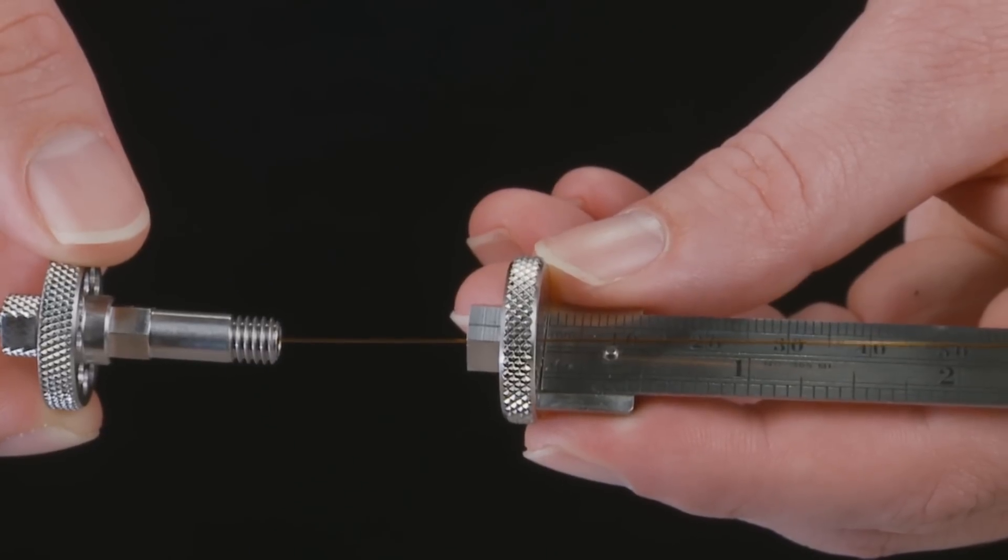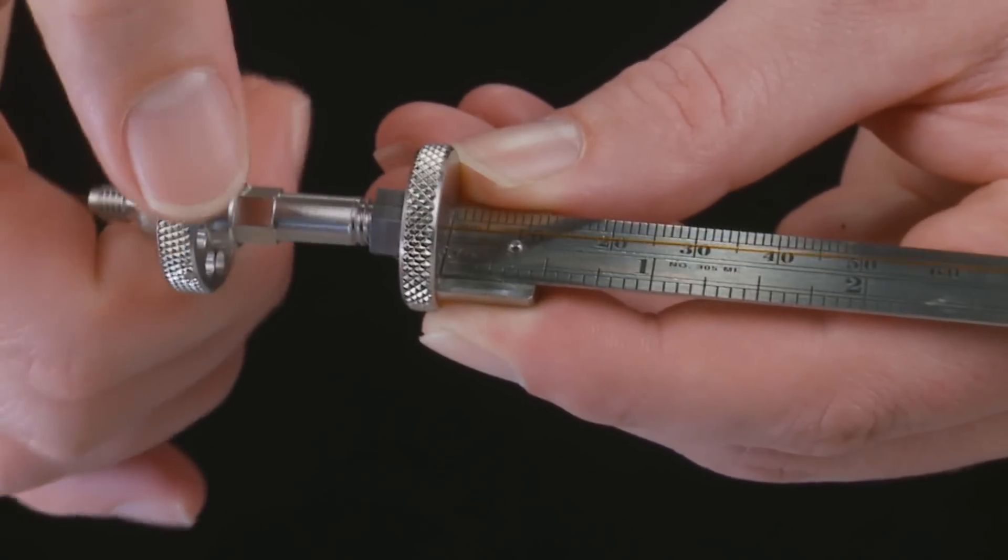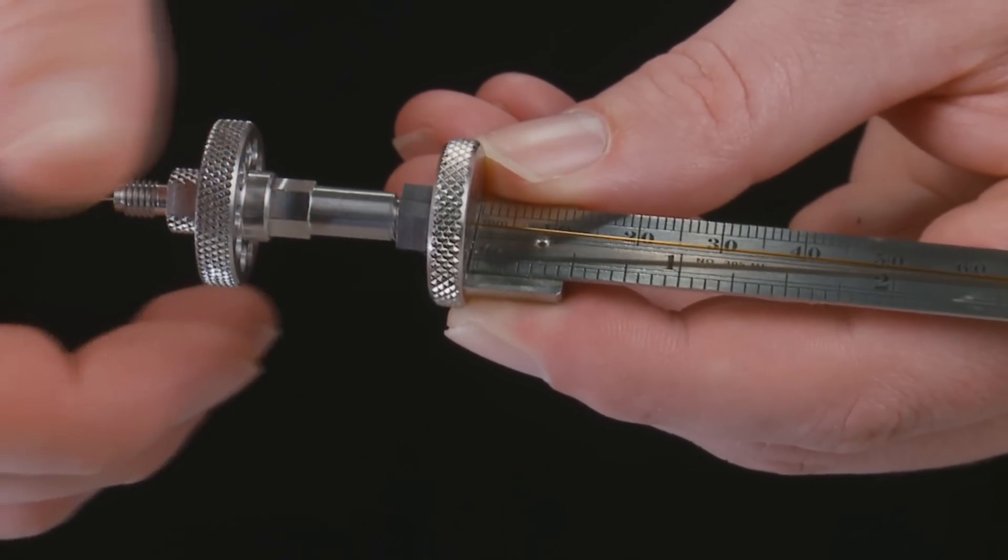Insert the end of the column and the cool lock nut into the bottom of the cool lock installation gauge. Hand tighten the cool lock nut into the gauge until the upper ferrule begins to compress.